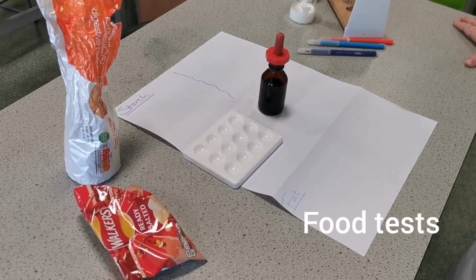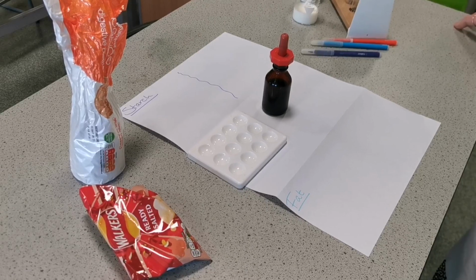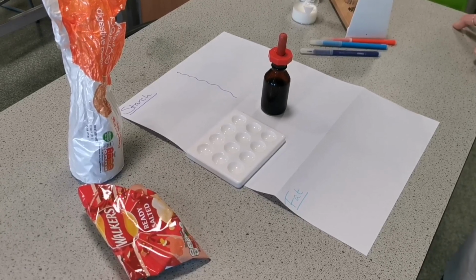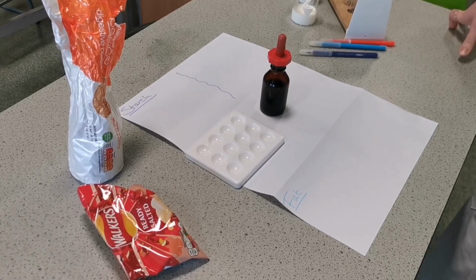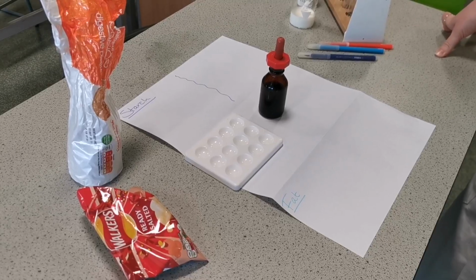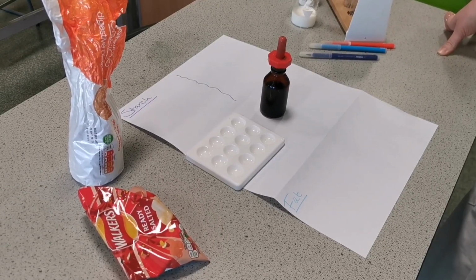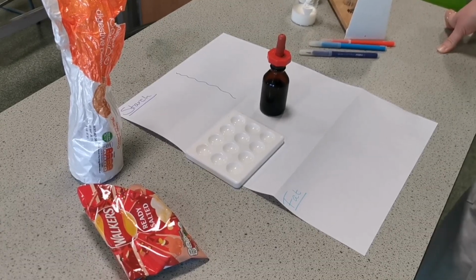Hi everyone, this is lesson 2 about nutrition, but this one is all about food tests. This is the practical. By now you should have read through the PowerPoint. If you haven't done that already, stop and do that now so that you understand what we're about to do. We're going to take you through how you can test for all the nutrients in your food and the different tests that you need to do that.